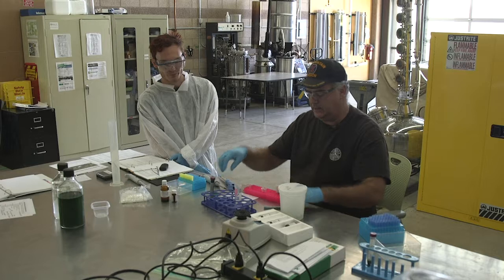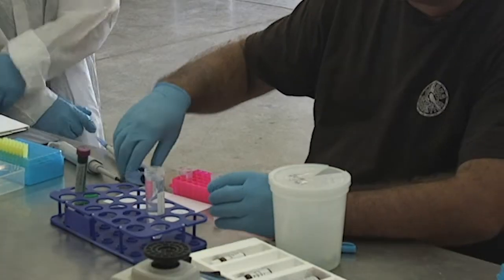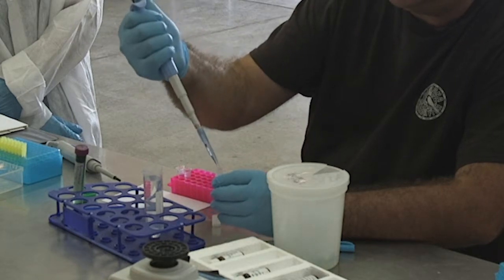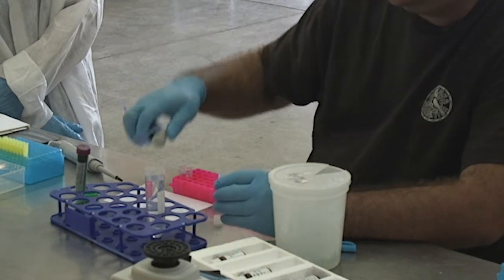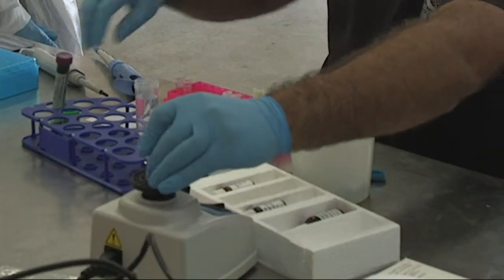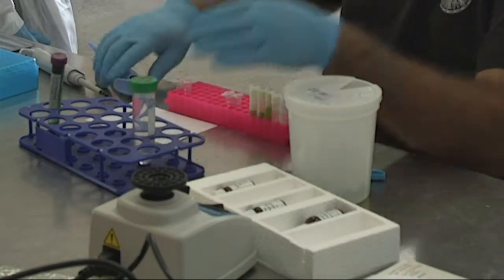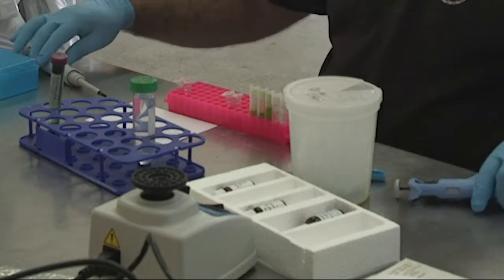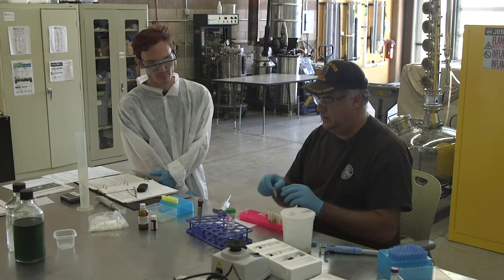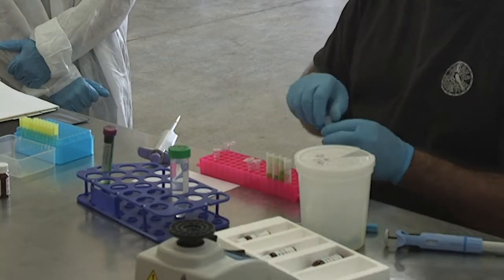Each of them will add 290 microliters of this MOPS buffer that we've prepared according to the instructions of the manufacturer. And then after we've done that, we add 10 microliters of our first enzyme. This is alpha amylase, and this enzyme digests the amylose that we've released.